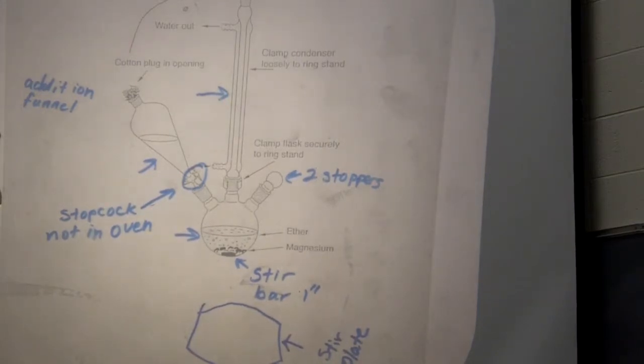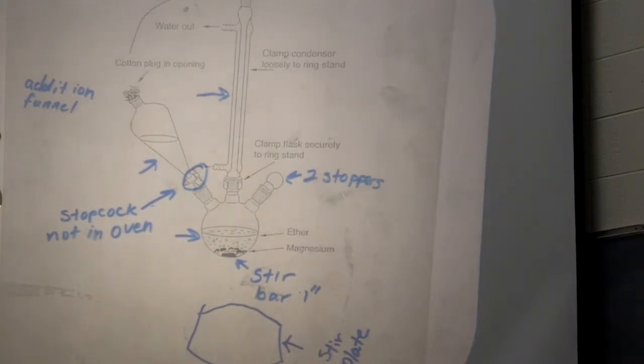So our alkyl bromide going into this reaction is a very exothermic reaction. So that is part of why we need to make sure that we don't get things going too out of control, because we now have a very flammable situation, okay? We've also talked about why you don't want all your alkyl bromide added at once, because you're not going to get out of it what you want, okay? So you need to control it for the reaction's sake, but also for safety's sake, keep things under control, okay?